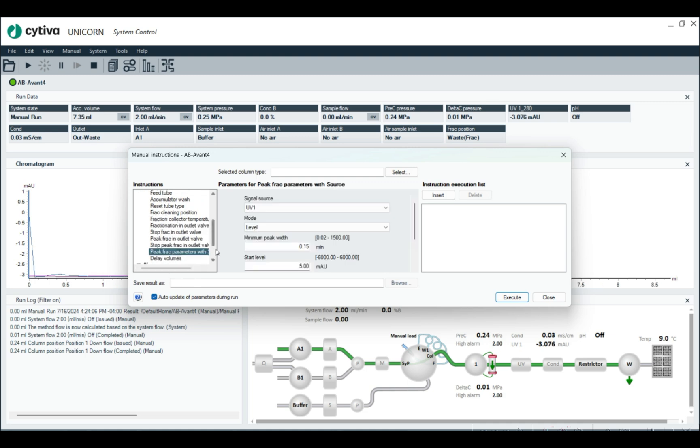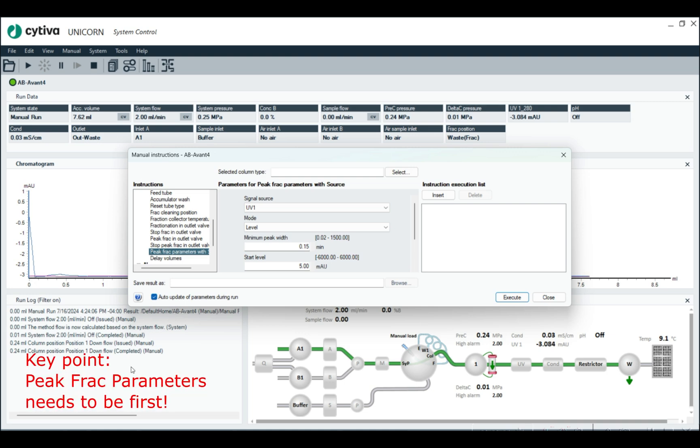The trick is you need this instruction, but also one other instruction, which is this one right here, peak frac parameters. And peak frac parameters has to be entered into the run log first.